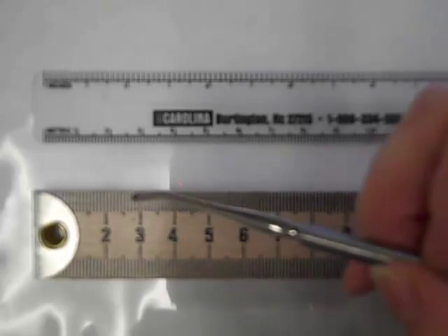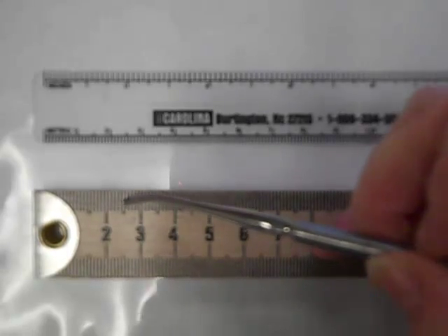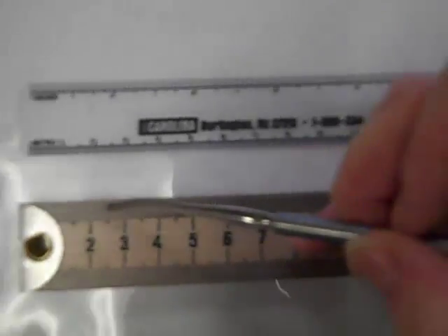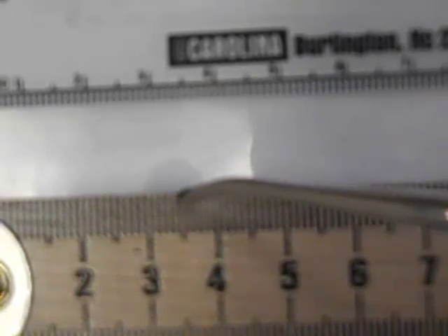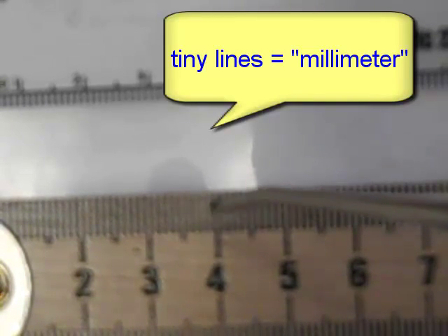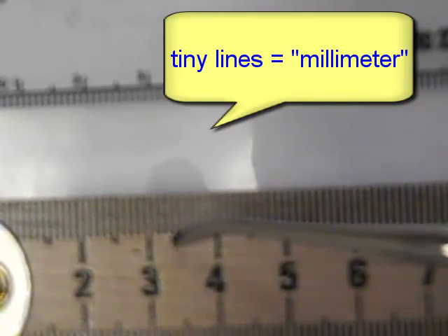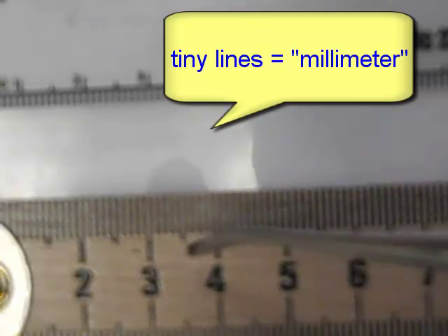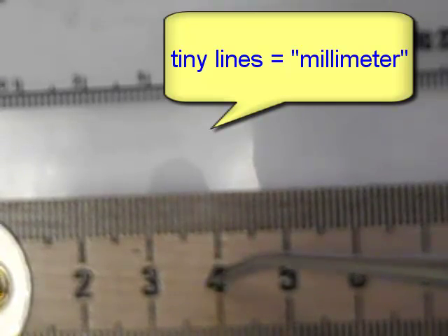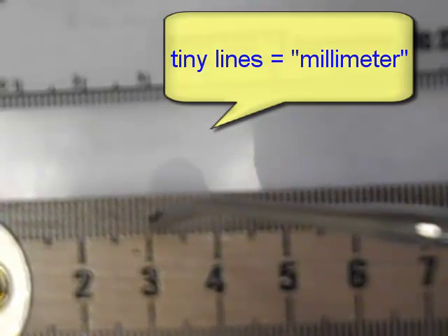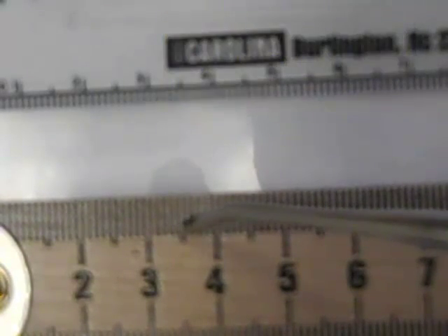The individual little lines, and we're going to zoom in. When we zoom in on the individual lines in the ruler, those are the millimeters. So between each number, the centimeters, there are 10 individual millimeters.